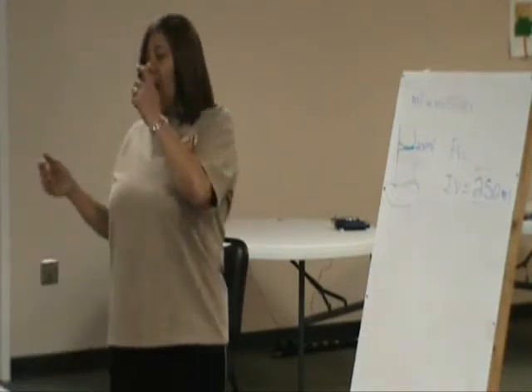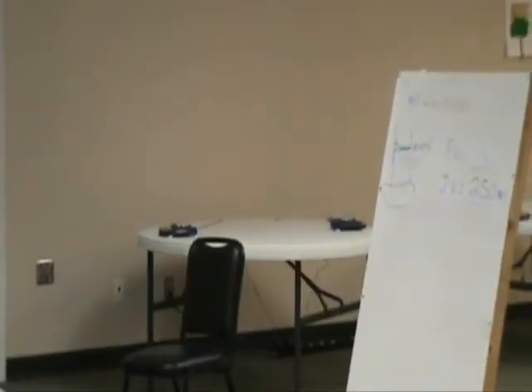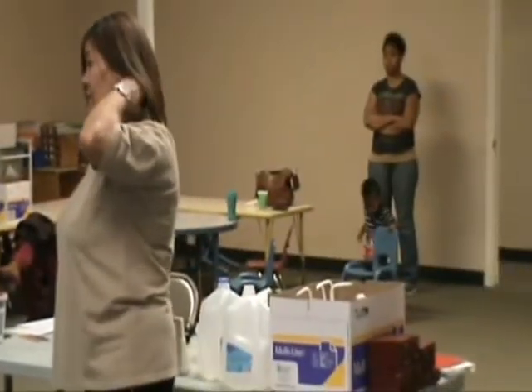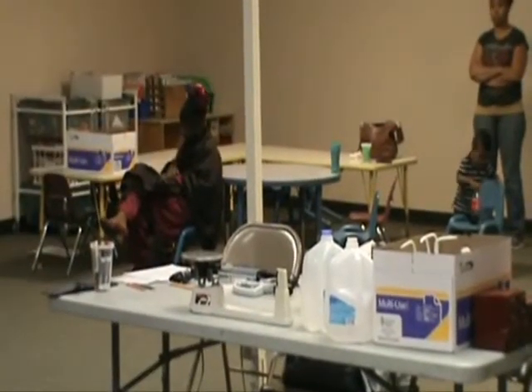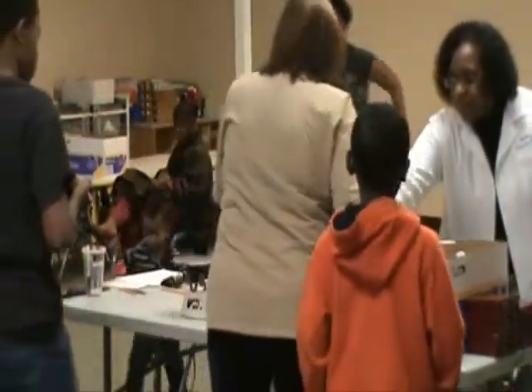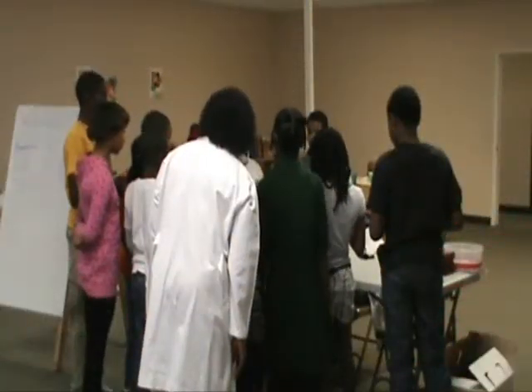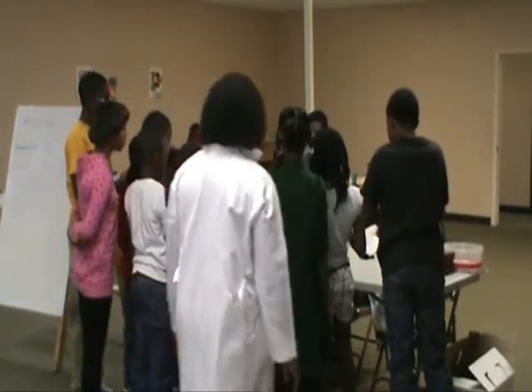Now, at this time, I want you to take your metal and come over here, and I'm going to show you how to use it. Put your seats back. Be careful in the laboratory when you get up, because if you have glassware on your table, don't bring a seat with you. That's fine, Chris. Can you get that seat for me, young man? Thank you so much. Okay, now, come around. Some of y'all come on this side.